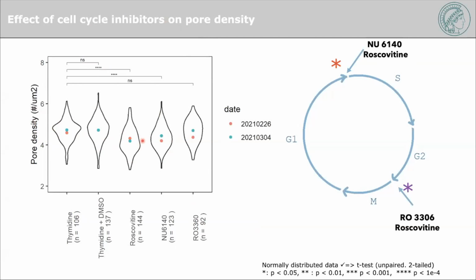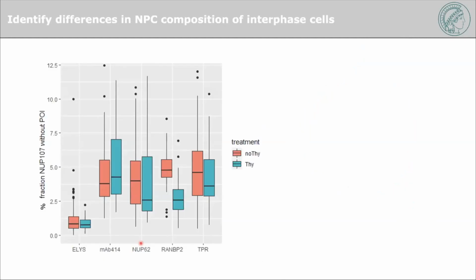and then check for different drugs, even very small changes, because this was in fact only 2 experiments for one of our students. And you could imagine you can do much more than this very easily, a third overnight experiment, to increase the number of samples. And then also identify very tiny changes in the composition of these nuclear pores in interphase cells.